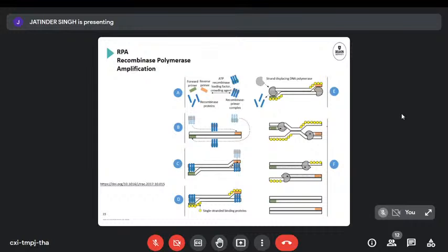These different isothermal amplification techniques are all similar but different. So we've got recombinase polymerase amplification, which is fairly similar, where we get a strand displacement step. We then get the primers to bind and replicate the DNA and get the cycle to go all over again. The difference with PCR is that the strand displacement here is not done by thermal melting, but it's actually done by an enzyme. And that means that the amplification can be done isothermally.